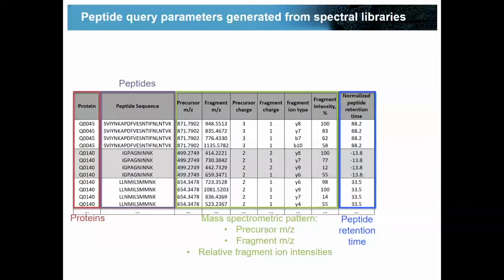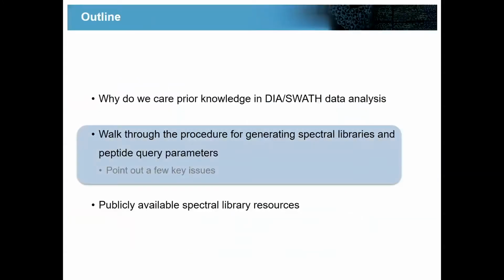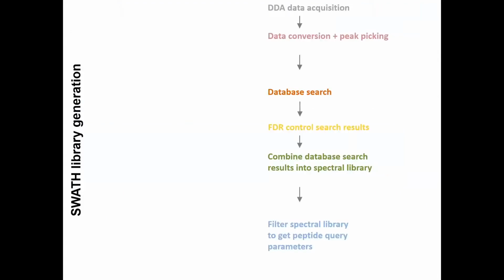The first tutorial will be the spectral library generation tutorial, and the goal that we are going to try and get to by the end of the day is a table that looks like this. Okay, so let's take a look at what this procedure actually looks like.